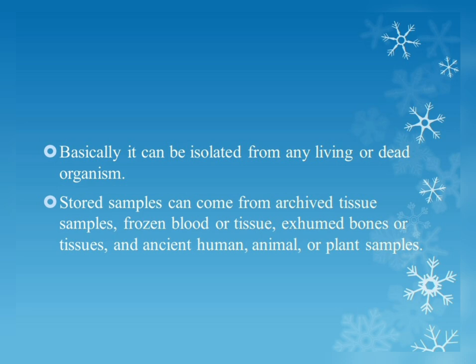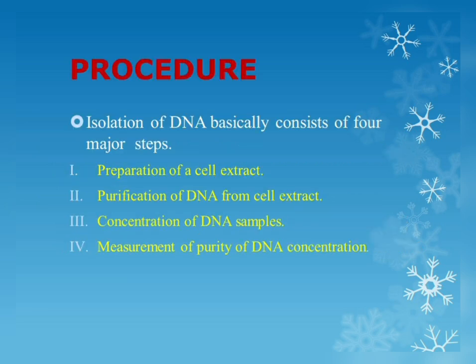The stored samples can come from archived tissue samples, frozen blood or frozen tissue, exhumed bones or exhumed tissues, and ancient human, animal or plant samples. Next, now let's come into the procedure.